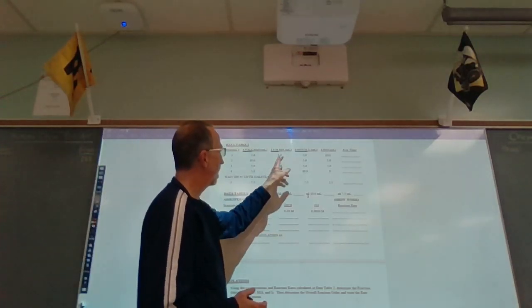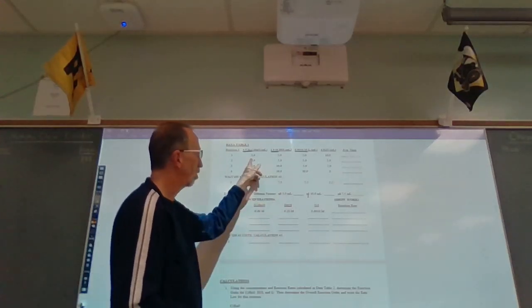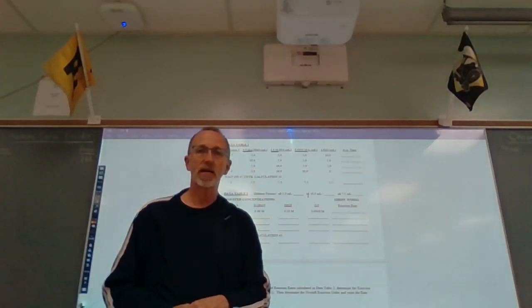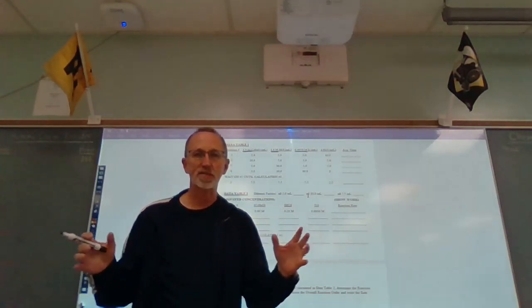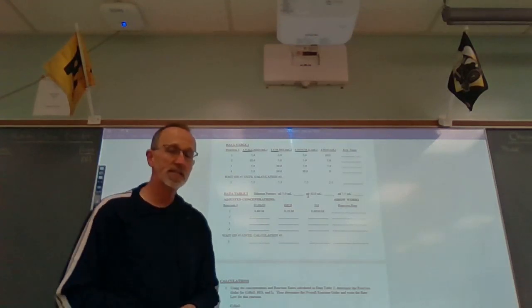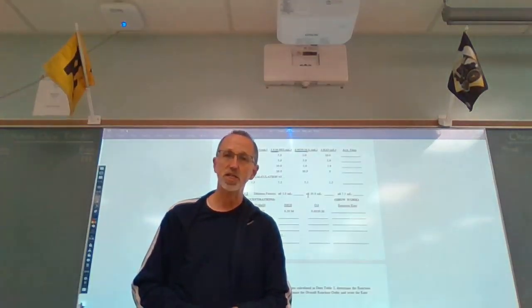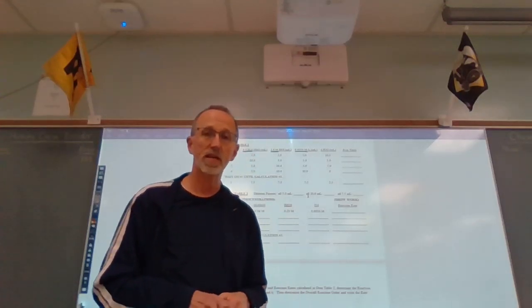But when we add in the HCl, the iodine, and the water, the number of acetone particles remains the same, but the volume of the entire solution has gone up, which means that the concentration of the acetone has been diluted. So think about that.